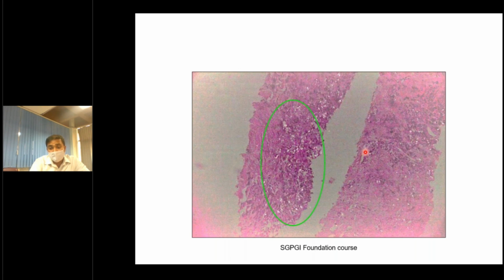But if a clinical history had been mentioned, such as a person working in a factory where the chances of pneumoconiosis are there, and if X-ray findings had been given, it would have aided the pathologist in giving a correct opinion. Otherwise, with specimens like this, without any clinical history, we will be giving a descriptive report which may not be of any help to you.